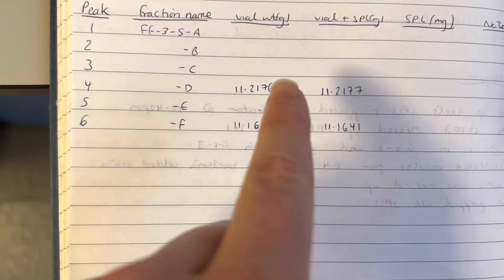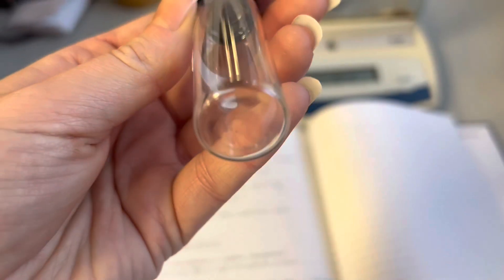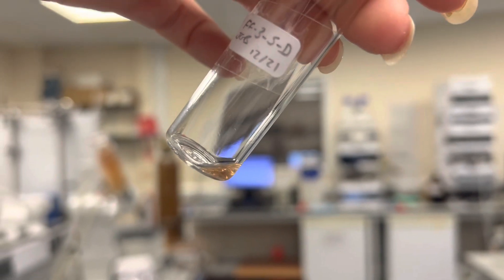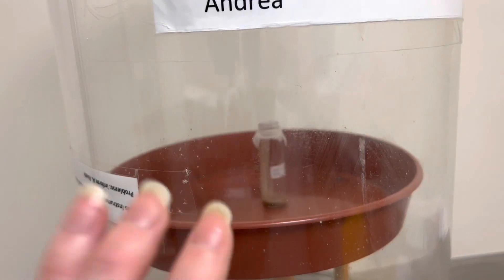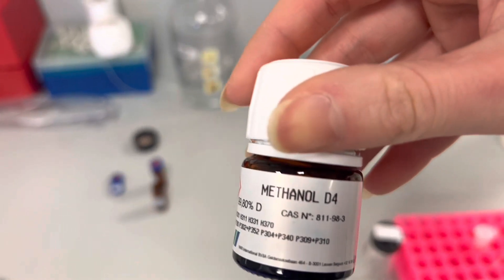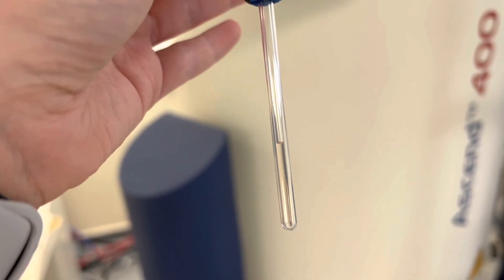The harsh reality of doing natural products work — this is the weight of my vial, this is the weight of my sample from the HPLC isolation, and there is literally nothing there. This was the vial from the last video, from the round bottom flask where it looked like there was a nice compound, and now yeah, I don't know where it's gone. Actually, I take it back — there is something in the vial. I'm going to do the NMR and hopefully we have something nice. I've put the sample back inside and hopefully this time it does not melt and it actually freeze dries. Now, little NMR tube, please give me a pure compound — it's going in.